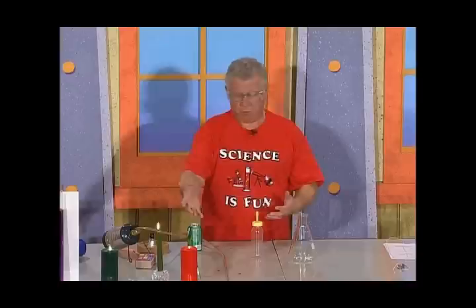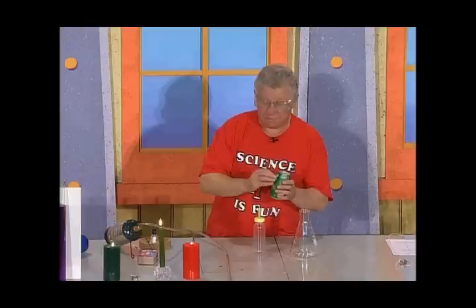When we burn something that has carbon in it, like wax or fossil fuels, then we form carbon dioxide. And carbon dioxide is a gas at room temperature. It has no color, so it's invisible. We can't see it. And also has no smell, so we say it is odorless. But all of us know about carbon dioxide gas because we know about carbonated beverages. And what I want to do next is an experiment to show you how much carbon dioxide is really inside a bottle of carbonated beverage or a can like this.